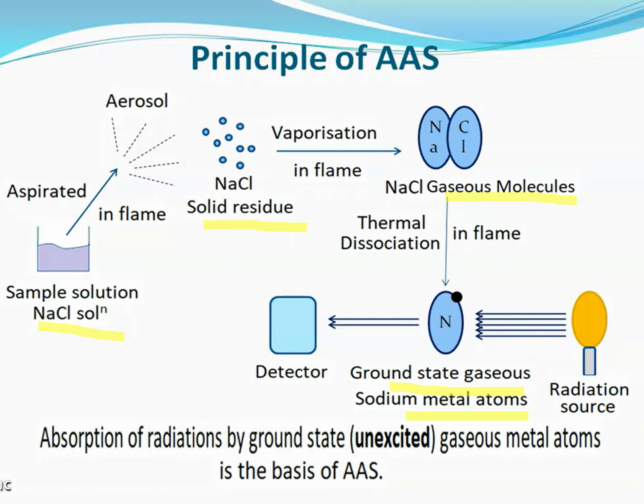But think yourself: in UV and fluorometry, what was our sample? I think in UV visible spectroscopy and fluorometry, our sample was a solution. Our sample was this. But in case of atomic absorption spectroscopy, our sample is the atom.